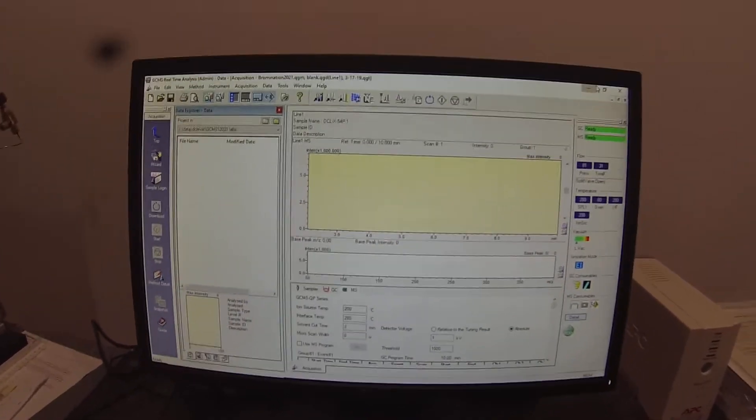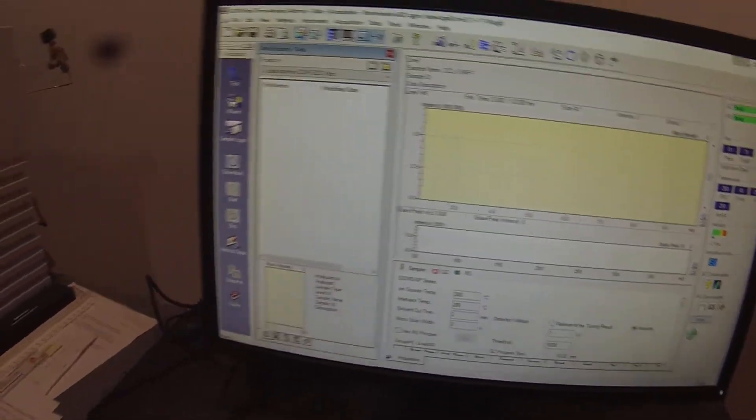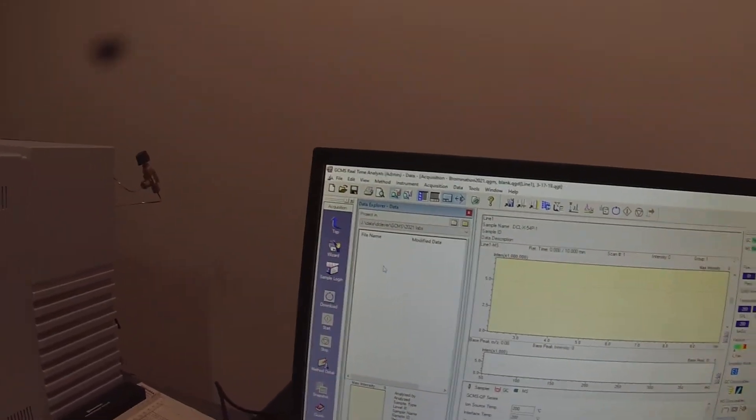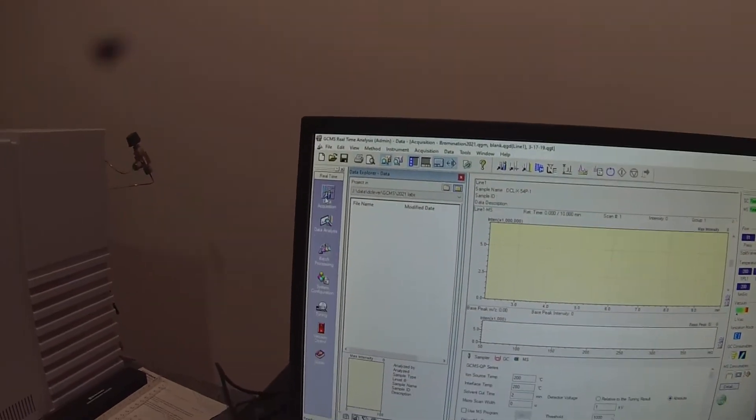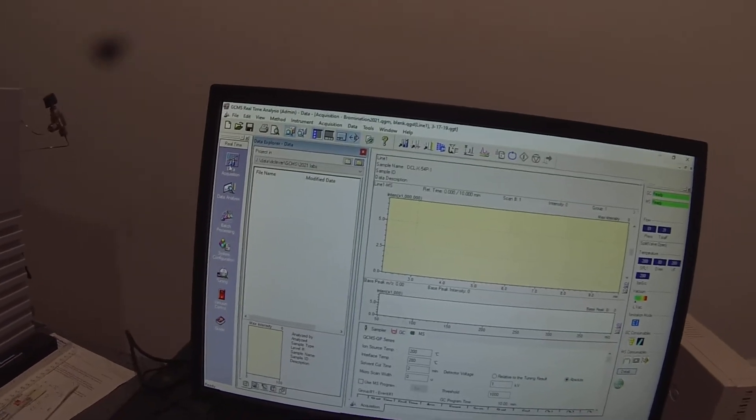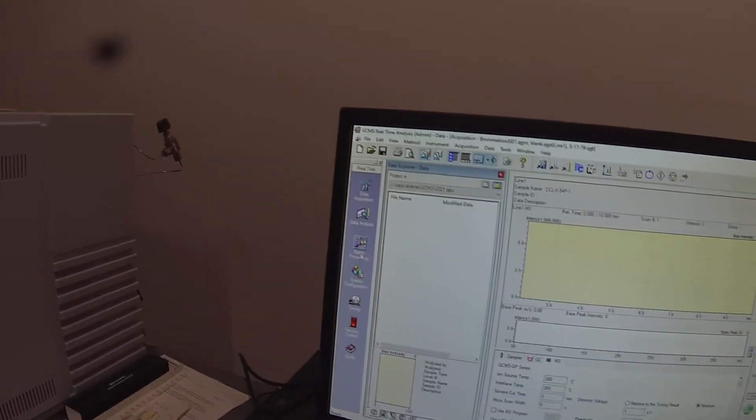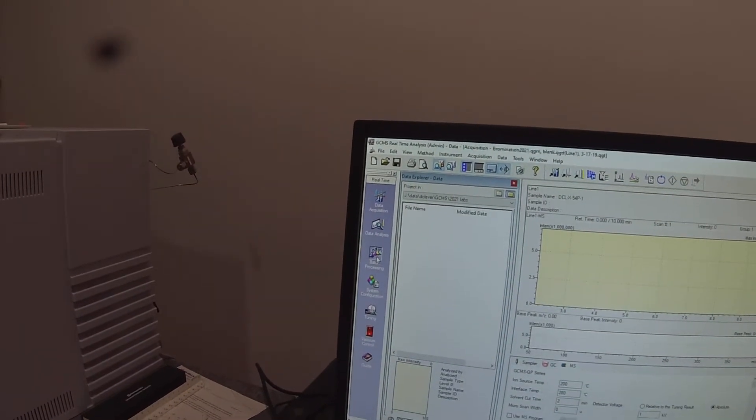So we are at the top menu here. And we want to do a batch file, so we're going to click on batch processing.